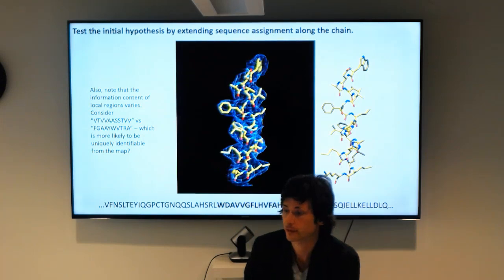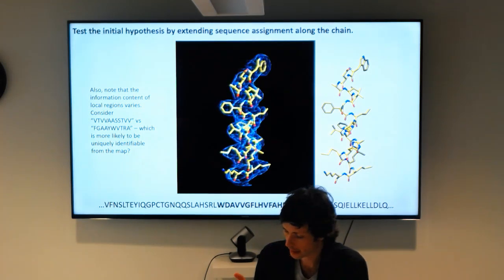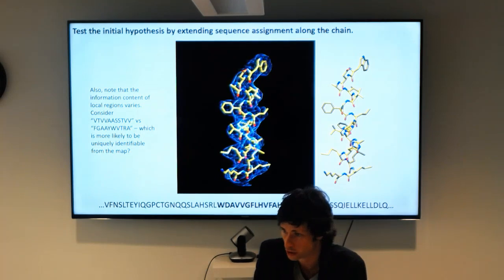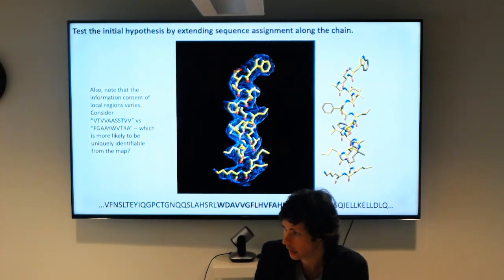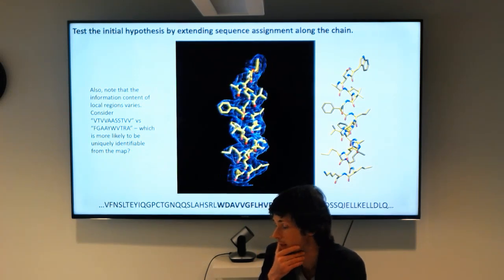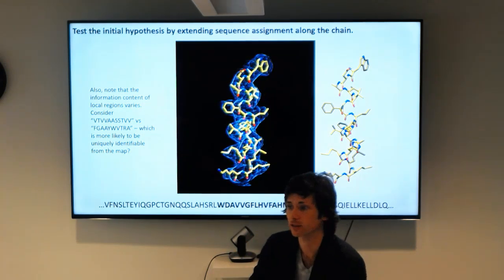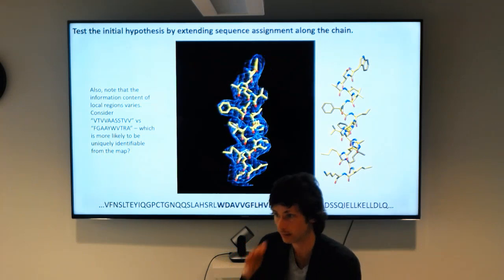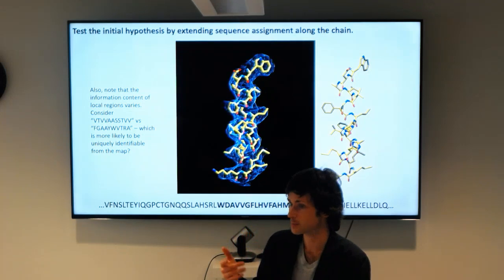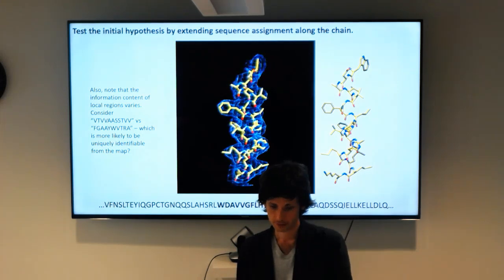One thing I would say is that is true for free glutamates and aspartates, but generally speaking, in my experience at least, if you have a negatively charged residue which is involved in a salt bridge, it tends to be much better preserved for some reason that I'm not entirely sure of. But yeah, you do have much weaker density for glutamates and aspartates. They are still there quite often, but you have to take the threshold a lot down. Exactly, and you gotta sort of calibrate your expectations of what a residue is going to look like for Cryo-EM versus crystallography in that respect.